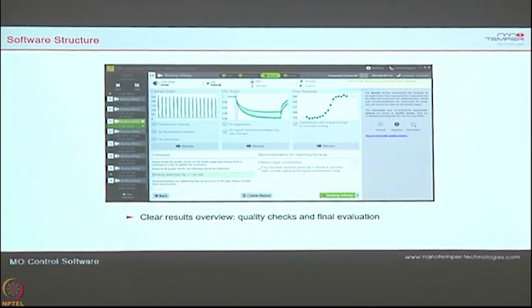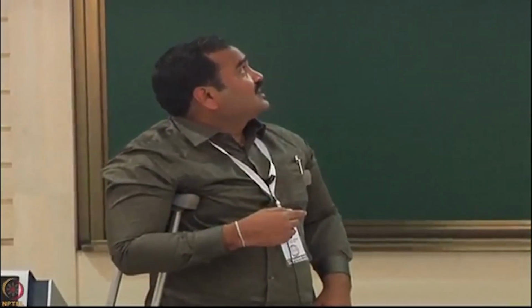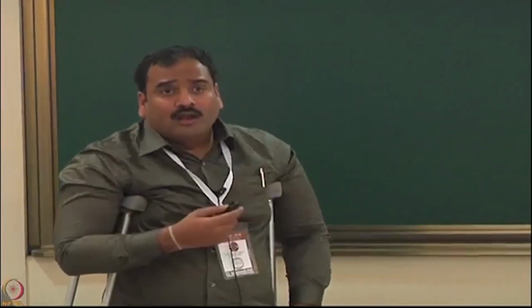Of course, as a user we always know technically what is happening with the software. By looking at the data we can always assess, but still the software will help you to make a judgment on your analysis, and you always get all the data in a single page. As you see here, this is a clean binding fit, and these are all the thermophoretic traces of all your dilutions that you have made.